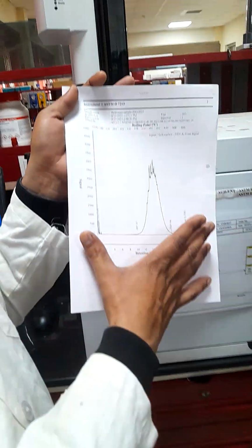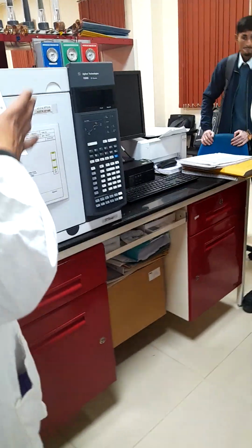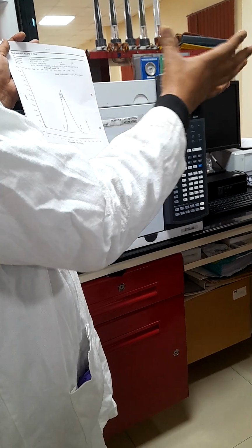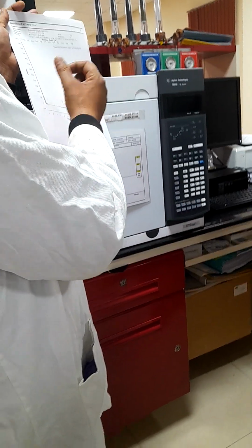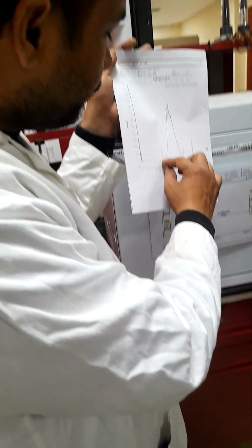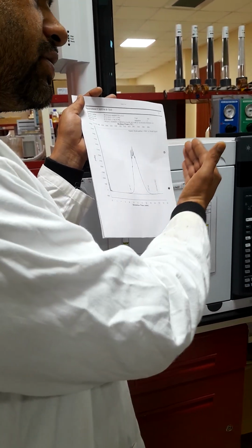Whenever you get a result for this 0 minute to 25 minute run time, in this temperature range, the detector will reach a maximum temperature of 375. So this is the 100% area which we have received with this chromatogram. With the help of this chromatogram, we have achieved 100% area. But when the elution starts, the area will rise. So 0.5% of that area is covered or marked as the IBP point.